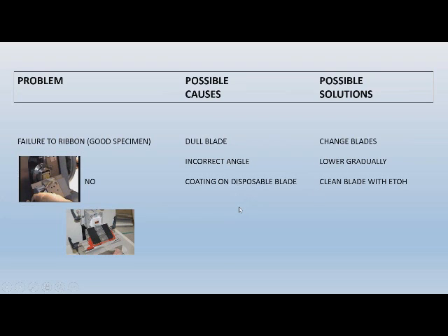Here's an interesting thing. How many of you know that some blades are coated? As a matter of fact, a lot of blades are coated, and I think it's fairly common knowledge out there.